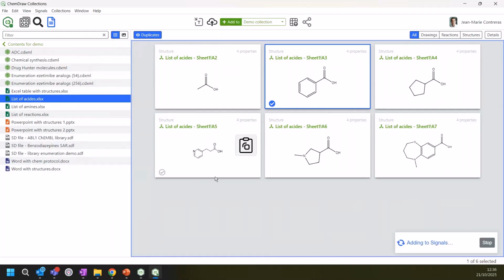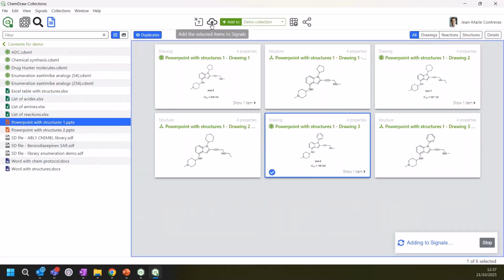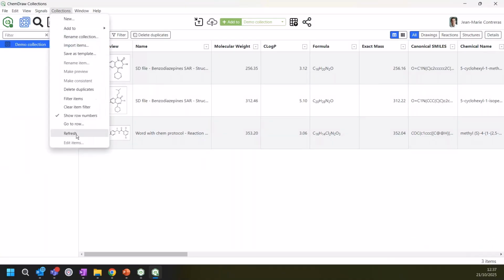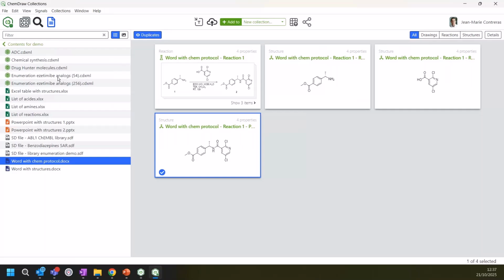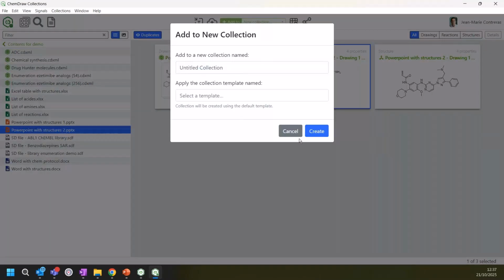Let's add it to the collection that I just created. Let's go to this part one, select, for example, this one, add in here. Let's take another one here, maybe this one here, and add it to the collection. Now, if I go to the collection view, I can refresh probably. Okay, it's in the collection.